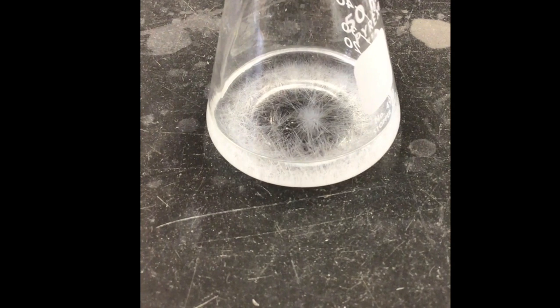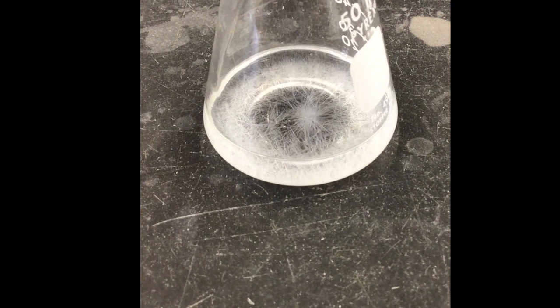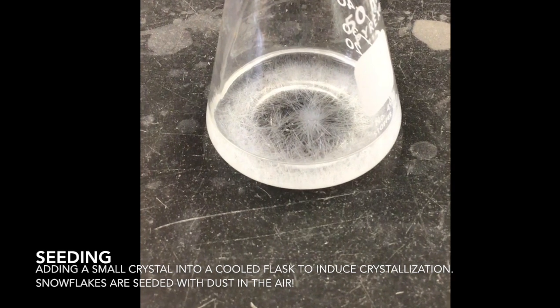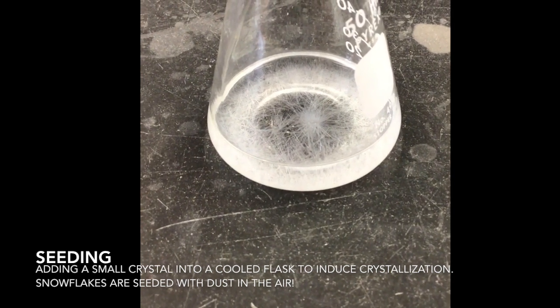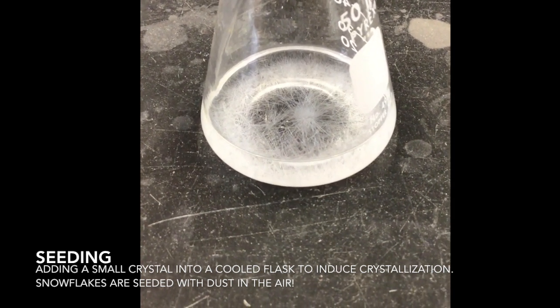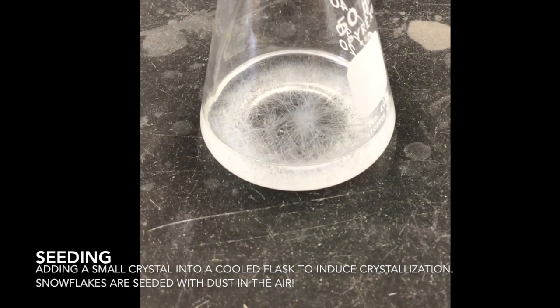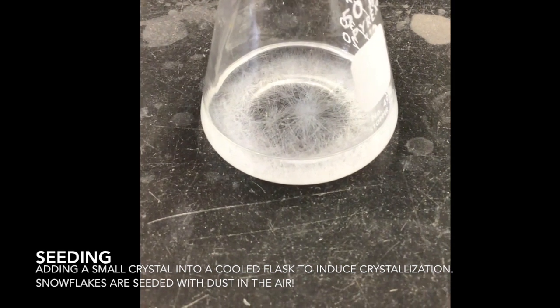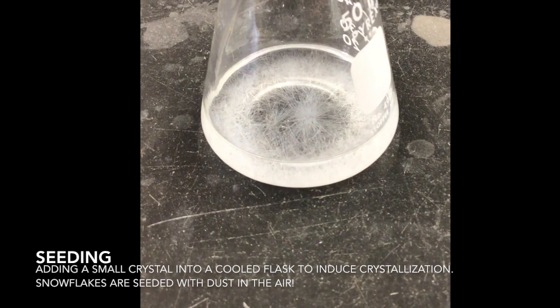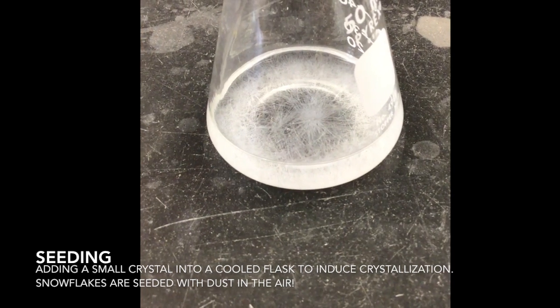But that nucleation site, once it's formed and you form a tiny crystal, that's all you need to make it pop off, basically, to form something that we're looking at, like right here. And you can also add a tiny crystal to a solution that you're trying to crystallize. If scratching it didn't work, a tiny crystal can act as a nucleation site as well. So if I had one of these needles and one of my lab mates was struggling to get theirs to crystallize, I can add a tiny needle to their sample, and it might help serve as that nucleation site for more caffeine to crystallize.